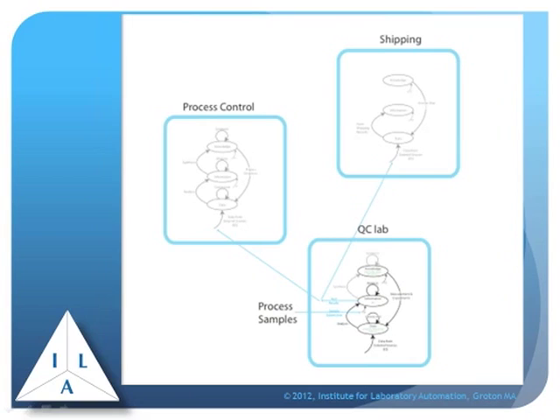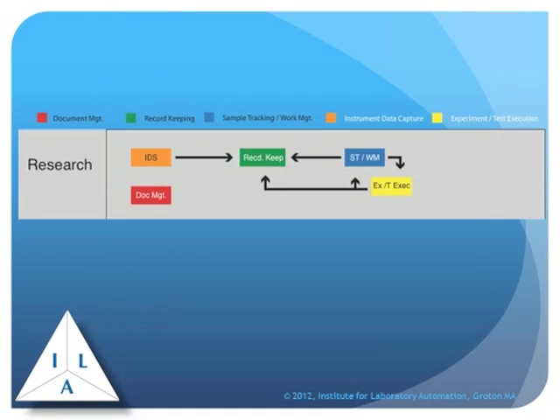So if you're looking at an integration program, if you're looking at the purchase of a LIMS system, you can look at how these products are going to affect the productivity not just of your laboratory, but also the productivity of the other organizations. If you can speed information flow from the laboratory into process control and shipping, it means you can get products out faster. It also means you can provide tighter control of the process and provide higher quality products.